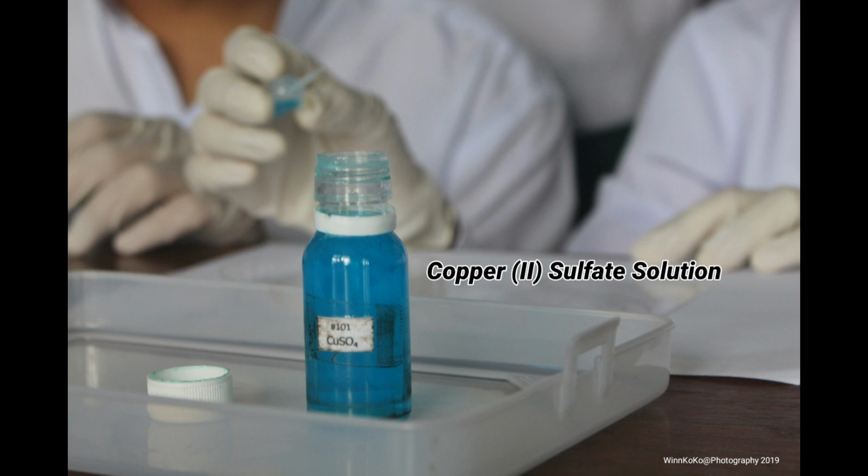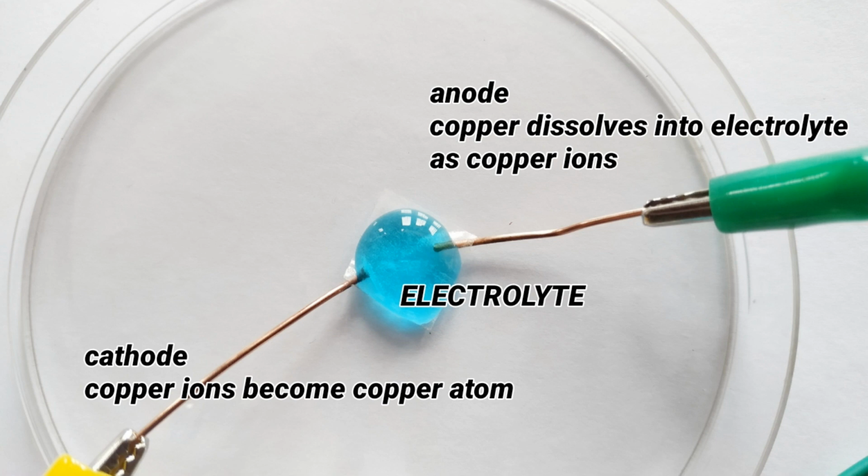In this experiment, we'll use copper sulfate solution as the electrolyte. During electrolysis, the electricity passes through the electrolyte, making the ions in the electrolyte move to their respective electrodes and then discharge. Electrolysis of aqueous copper sulfate using copper electrodes.